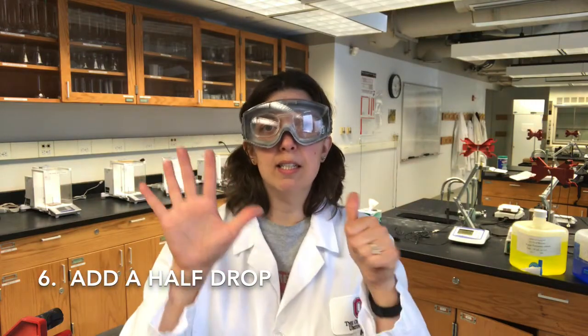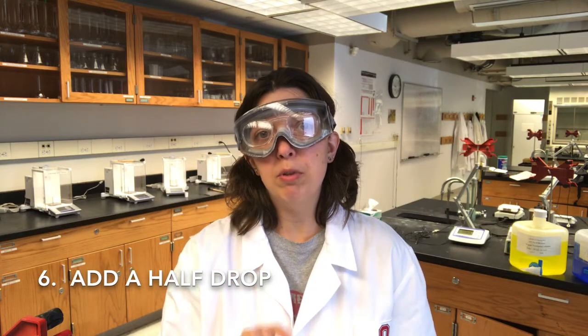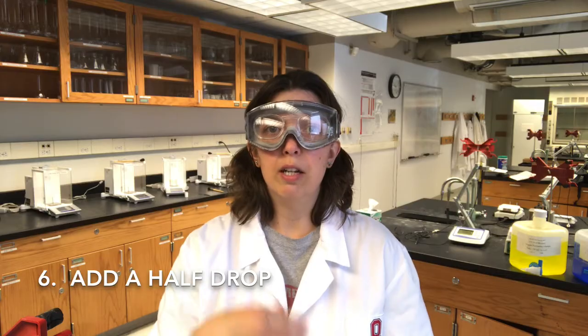And finally, tip number six: you can add a half drop of solution from the burette to, for instance, a titration mixture by getting a little bit of a drop at the tip of the burette and using water to wash that into your titration.